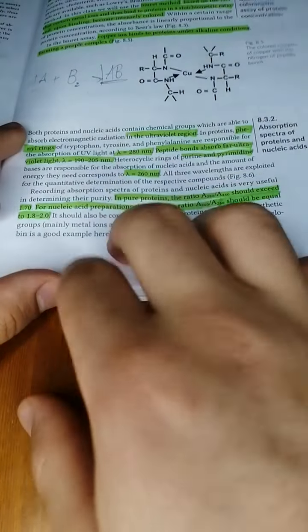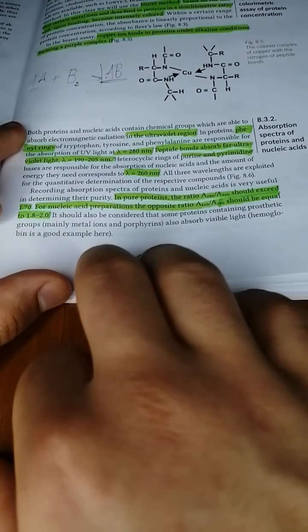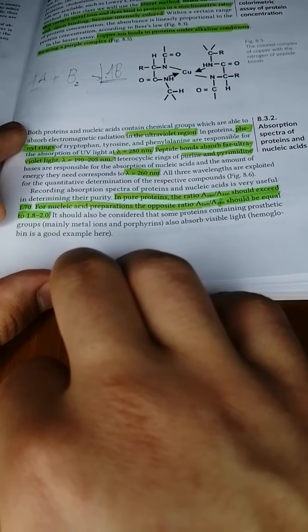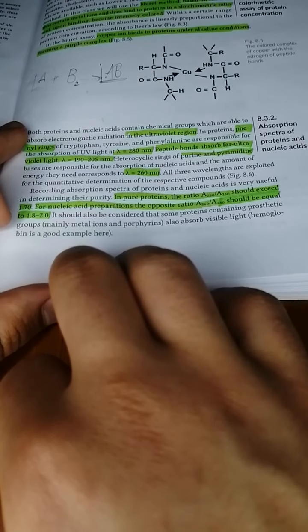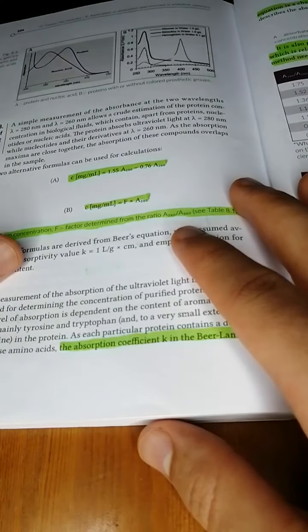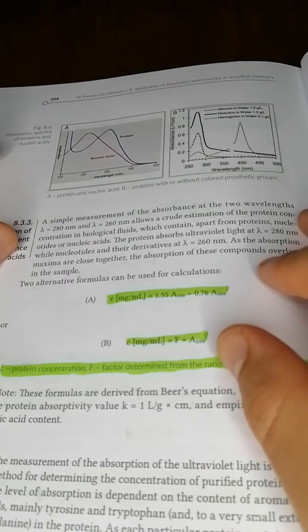The functional groups that we look for in proteins are not only amide bonds but also phenyl rings. These are sort of modified benzene rings. You can see them in tyrosine, tryptophan, and phenylalanine. You will see rings of hydrocarbons. After we have these two ratios, we can plug them into an equation to find the concentration of protein in the sample compared to nucleic acid.